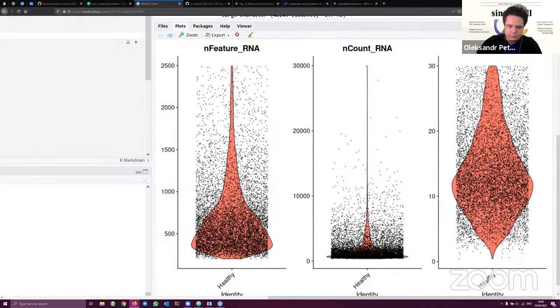So you should just cut off the upper outliers on the violin plot, and it depends strongly on the data that you are analyzing. Your violin may look completely different in another project, but just keep in mind you have the mean, then maybe 2-3 times more, and then cut off at the top.